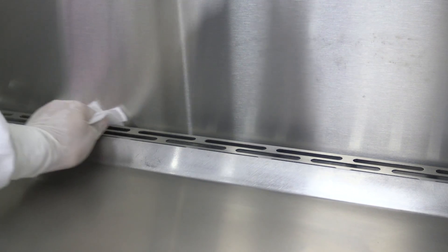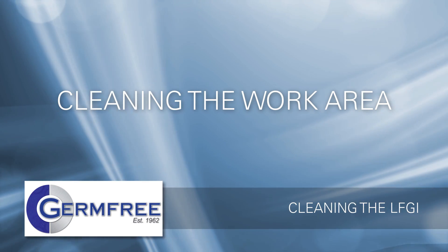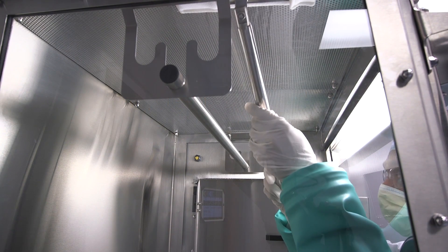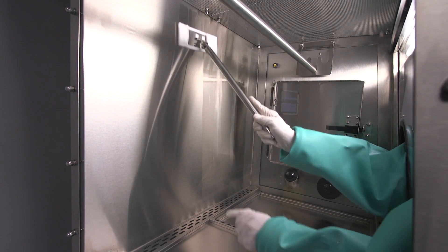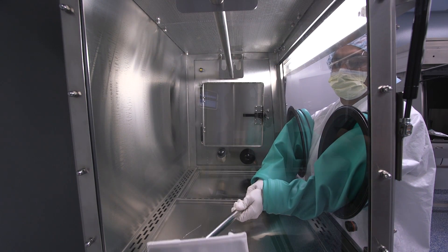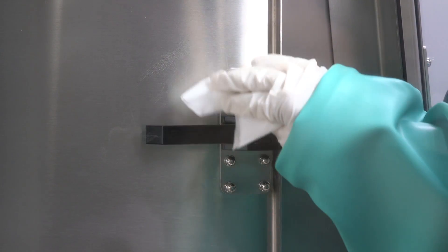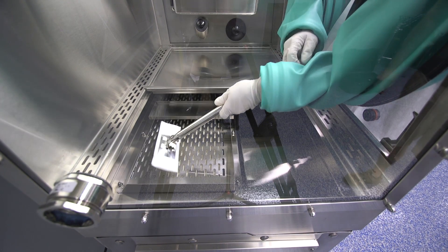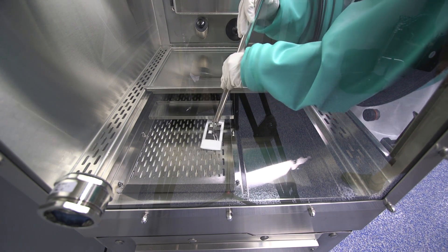Use wipes or cleaning pads to avoid dripping dirty solution onto cleaned surfaces. If needed, remove any disinfectant residue by wiping all surfaces with sterile water or sterile 70% isopropyl alcohol. Complete the following steps to make sure that the work area is thoroughly cleaned. Wipe all surfaces of the filter diffuser at the top of the work area. Clean the back wall of the work area. Clean both sides of the work area. Clean the airlock door, ensuring that all surfaces including the handle are wiped thoroughly. Clean all of the bottom work surfaces. You'll need to slide the left tray over the right tray to get below the work trays. Be sure to clean the sides and back under the slider work tray and the air return grill.